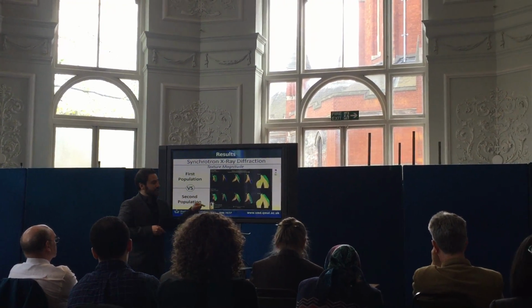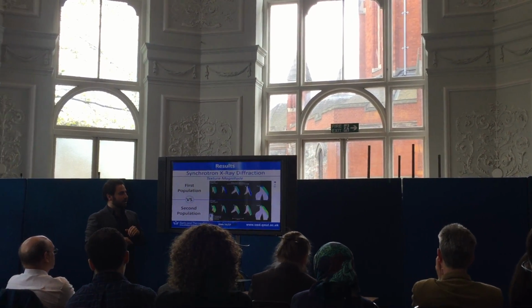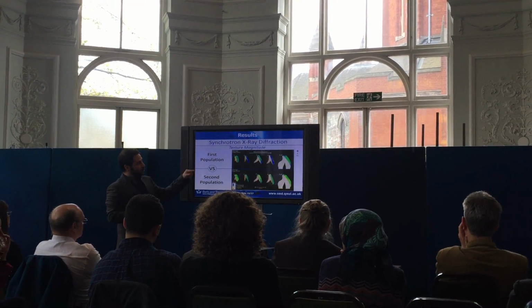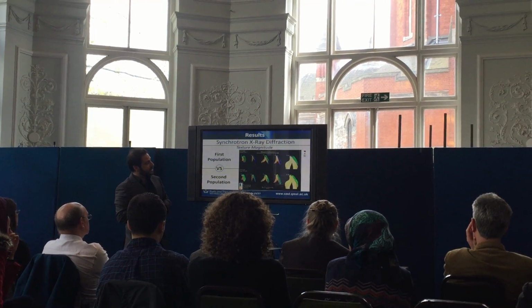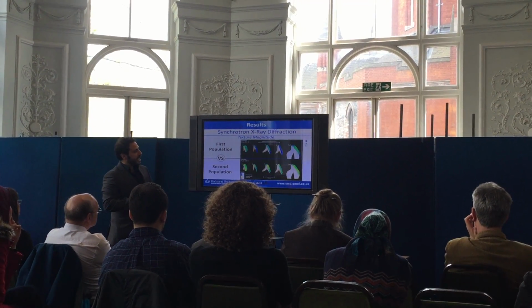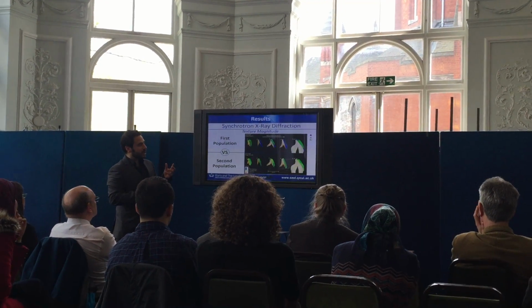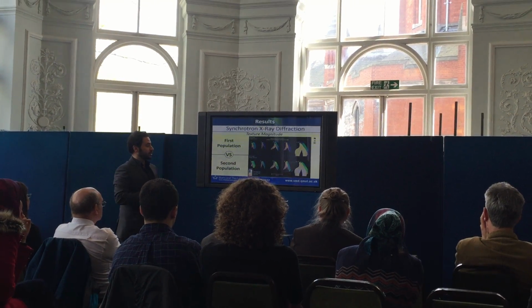I didn't find any relation in terms of maturation, but I found a difference between the 2 populations. Always one of them has higher texture than the other, blue being the highest texture, red being the lowest. This indicates that the crystallites within one prism population are similar, while neighboring prism populations have different textures.